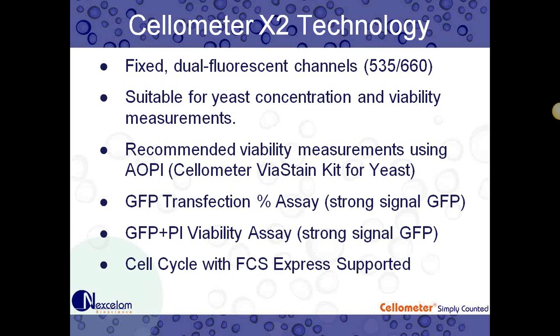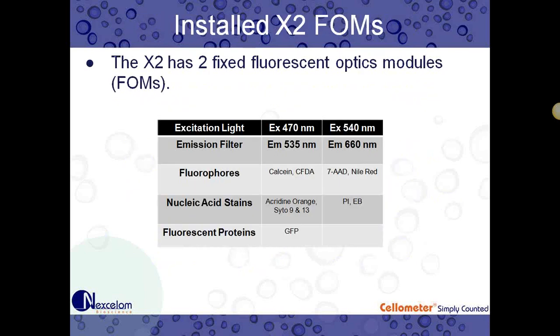And lastly, yeast cell cycle can be performed since the X2 has FCS Express software that can be used with the system to generate the cell cycle histograms.